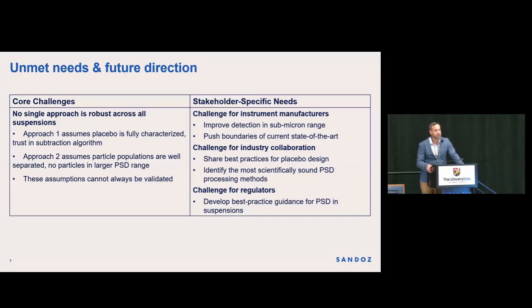In this case, it's not only about the method development, but it's also about the understanding of the product, using orthogonal methods, really to show, for example, are the particles above 3 microns, where we have the cutoff value, really present in the formulation? Can we expect them? How can we detect them? So this is all the work that needs to be included in the method development.